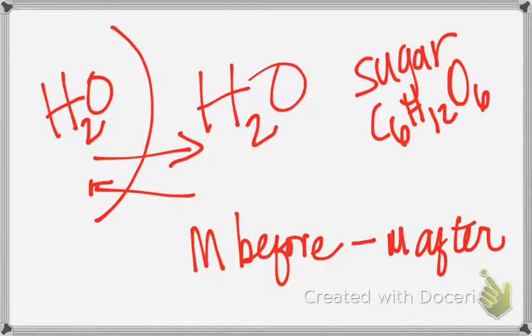Okay, question? Would we test for lipids too? Would we test for lipids? Would you expect there to be a lipid in an egg? Yeah, I would expect there to be a lipid in an egg. And you know what? There might be starch in your carrot, so we could test the water to see if there's any starches in it.